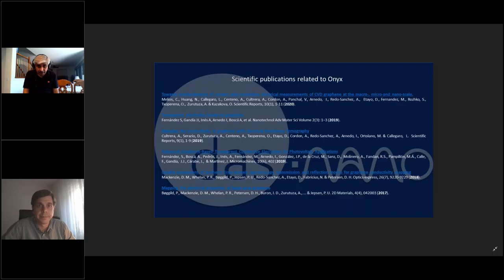Are there any special safety considerations when dealing with terahertz radiation, which users should be aware of? No, the power that is emitted by the equipment is very, very low, and there is no risk for health. No problem at all.